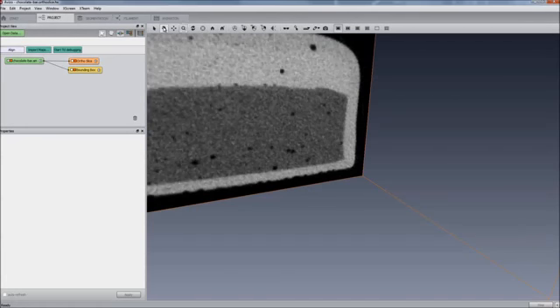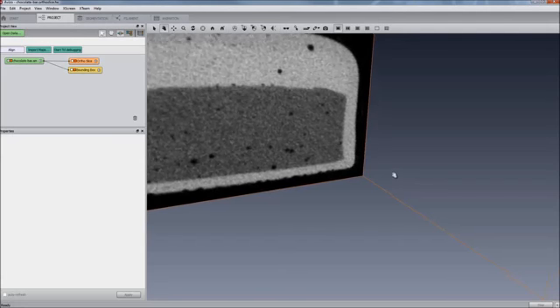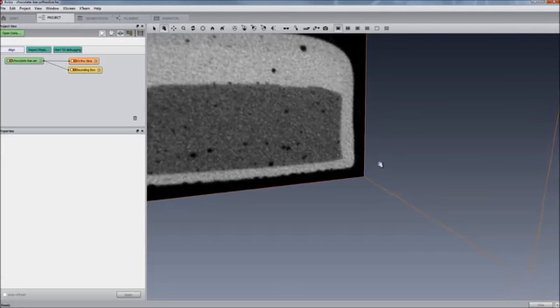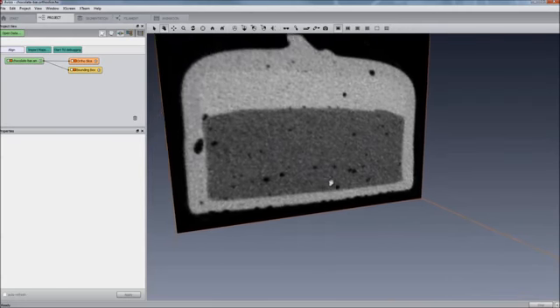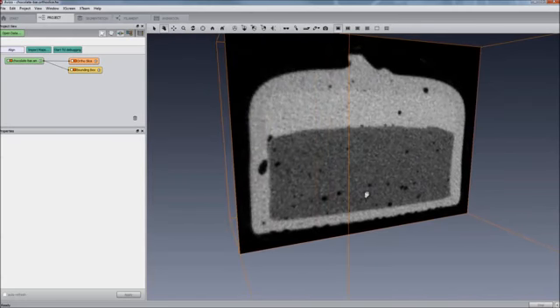Avizo provides shortcuts for an easier 3D experience. When in the trackball viewing mode, we can rotate the object using the left mouse button. A more direct way to pan the object is by clicking the middle mouse button to enter Translate mode instead of using the toolbar button.